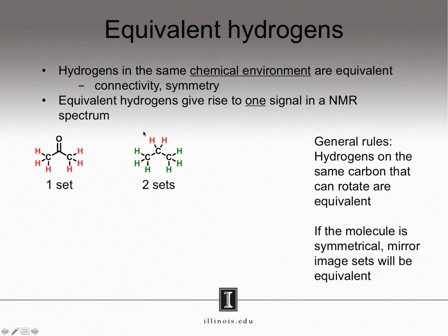In contrast, these red protons in the middle, while they are chemically equivalent to each other because they are attached to the same carbon, these red protons are not chemically equivalent to the green protons. Let's go on to another example.